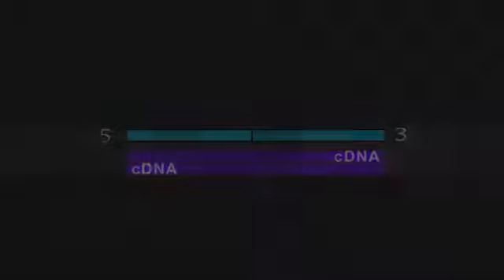Because we need a DNA version of our gene, we'll use the enzyme reverse transcriptase to make what is called complementary DNA, cDNA, from the RNA. And then we'll make it double-stranded using a DNA polymerase.